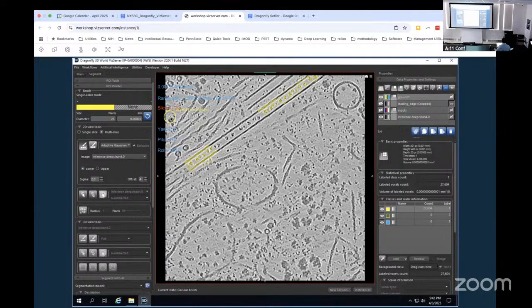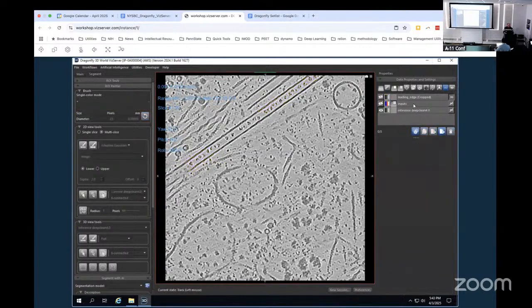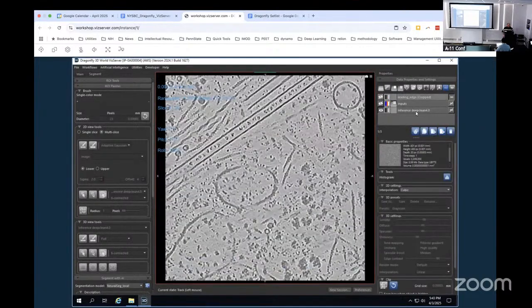Should we go back through making the ground truth the ROI? Yeah. I know I don't have a walkthrough up for you, so please just tell me to. I'm gonna delete this just so that we have to do it all from scratch. All right. Does it keep popping up? Yeah, I tried to put X or OK. Alright, so to generate a multi-ROI and the ground truth, go ahead.